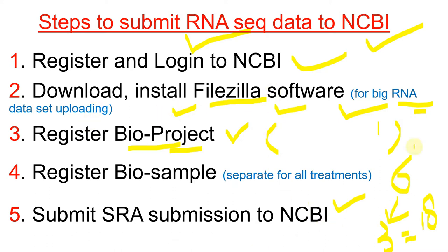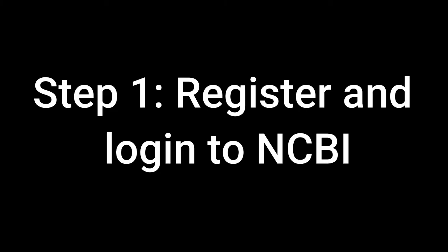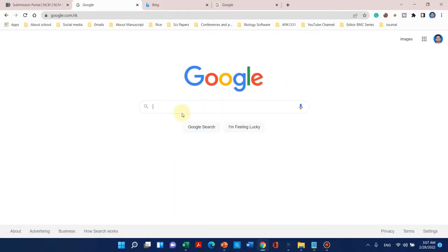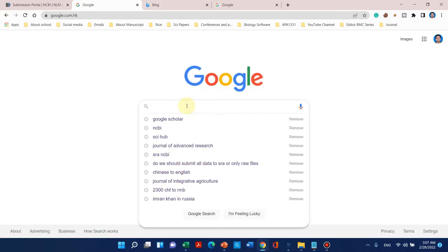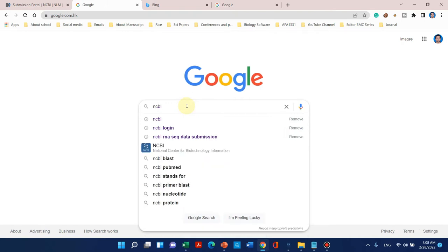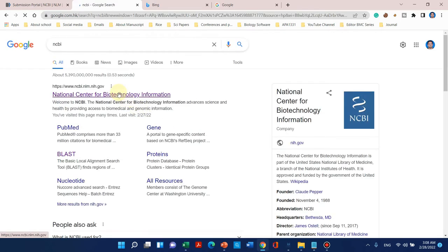The last step is the submission of SRA data into NCBI. This is the flow by which we can submit RNA-seq data to NCBI. Now let me take you to the computer screen where we can upload our NCBI sequence data. Let's open the NCBI website.